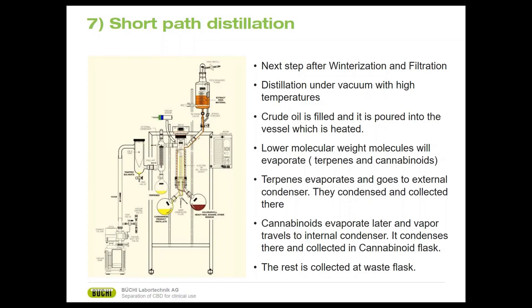During the run, you can't change the temperature. That's why you need to run the system twice. The first run will remove the terpenes, and the second run will remove the cannabinoids. If you use simple short path distillation, the temperature can be changed during the run. However, you must adjust the collection flask manually and change the temperature manually.